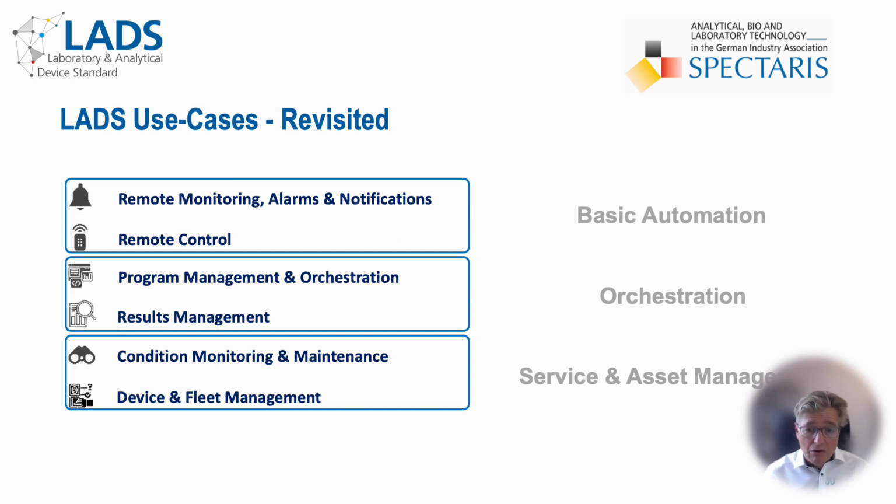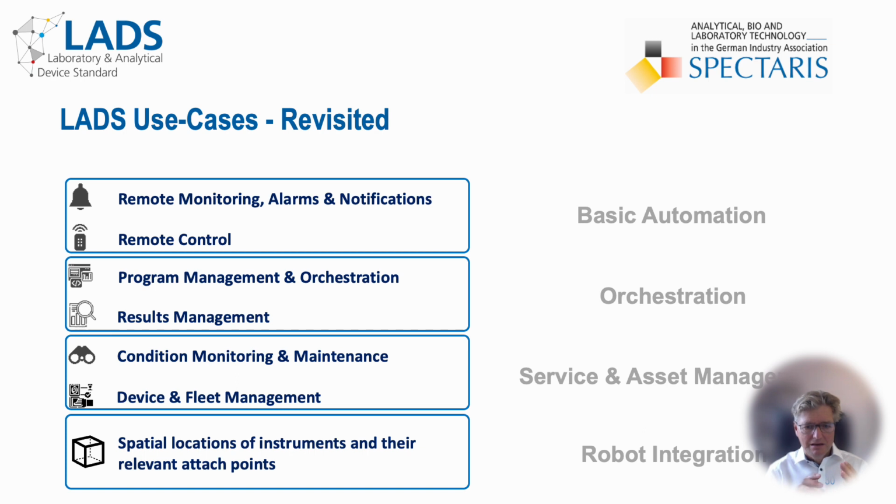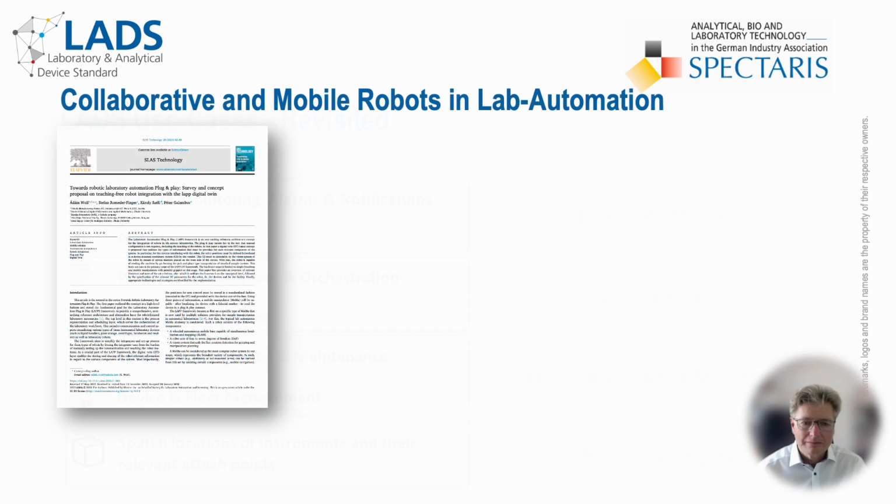To achieve our vision of integrating instruments with collaborative robots, it's essential to provide this spatial information in a standardized format directly via devices. So let's take the next step and add an additional use case covering robot integration. As illustrated, supportive robotic solutions are becoming increasingly important for life science and laboratories.